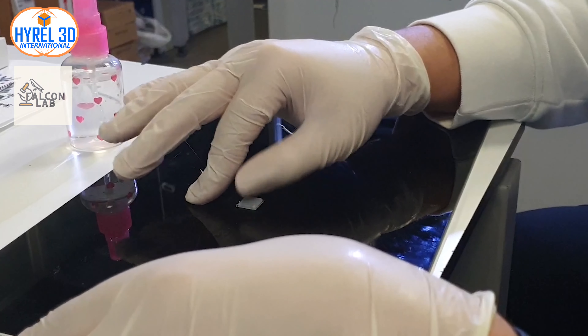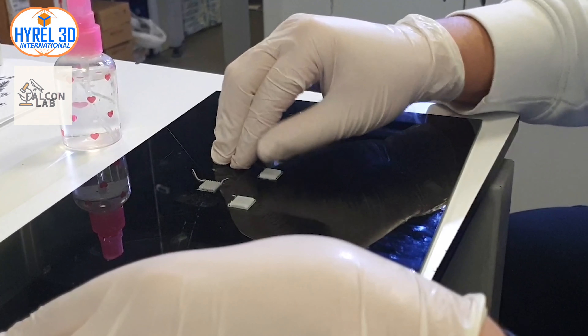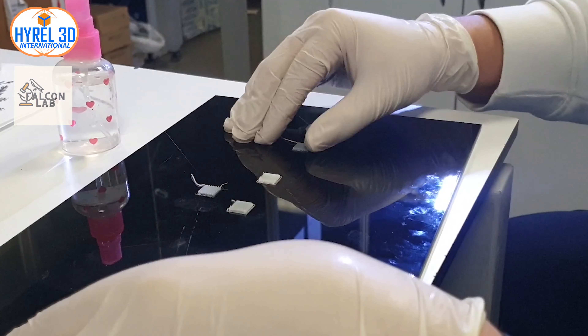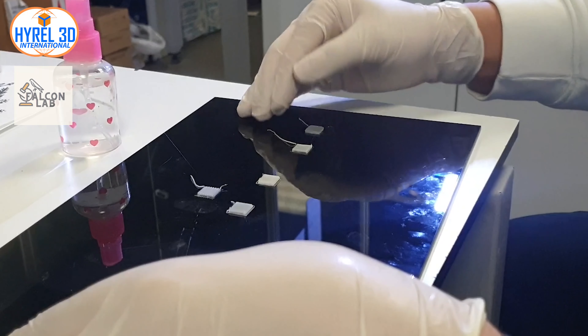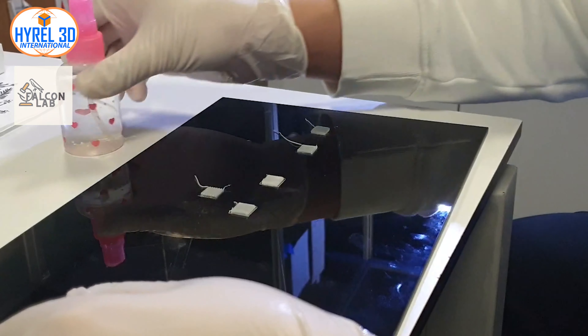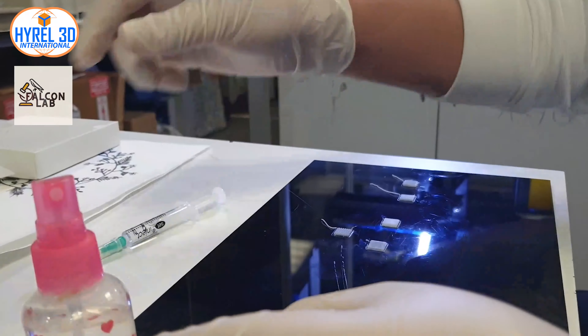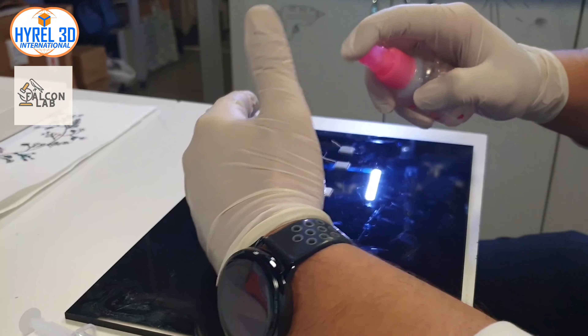After finishing your print, it can be challenging to remove the PCL from your print bed. I am using a PVC print bed — a polymer-based print bed may offer strong cohesion for the first layer, making it harder to take off your sample. I would recommend using ethanol diluted with water.